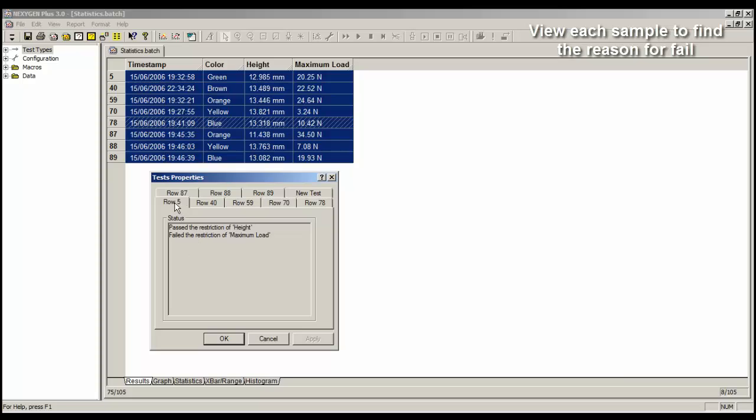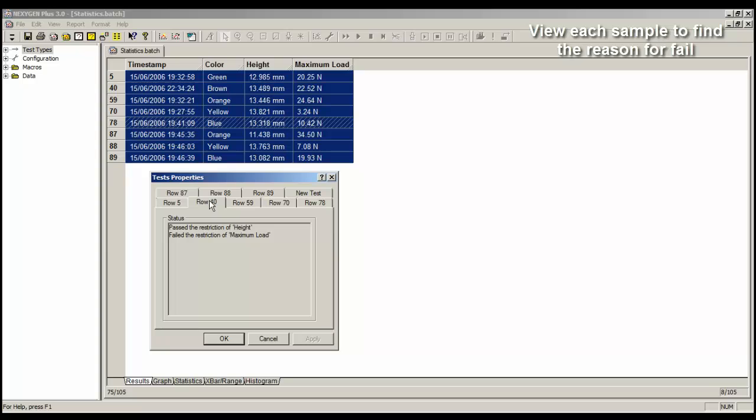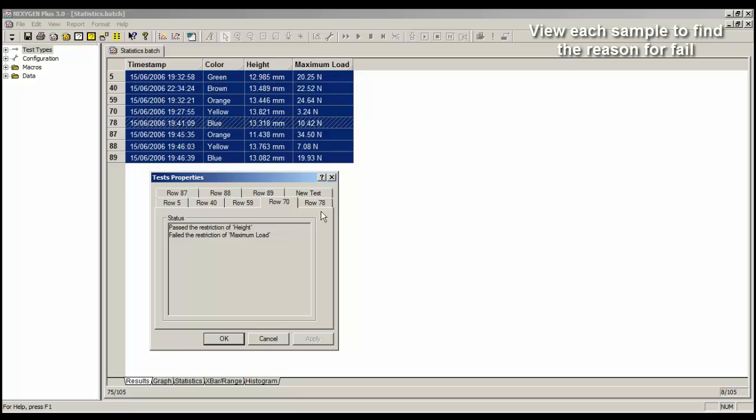And if I click on a tab, for example row 5, it tells me here the status of the pass or fail condition, and it says it passed height, but it failed maximum load. Let's look at row 40. It passed height, it failed maximum load. Row 59, again it passed on the height. Row 70, it passed the height. 78, passed the height.